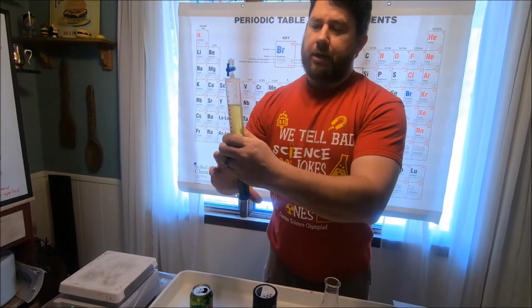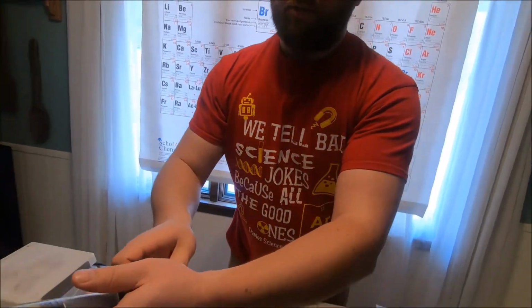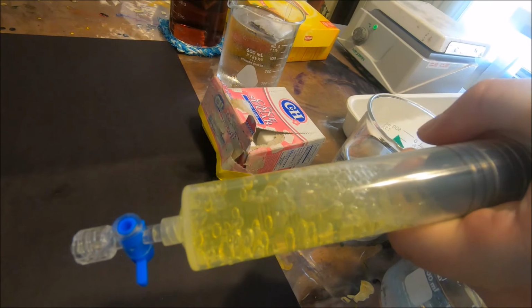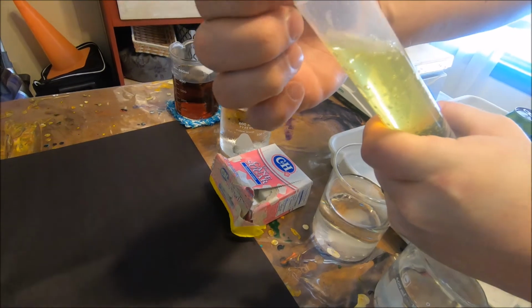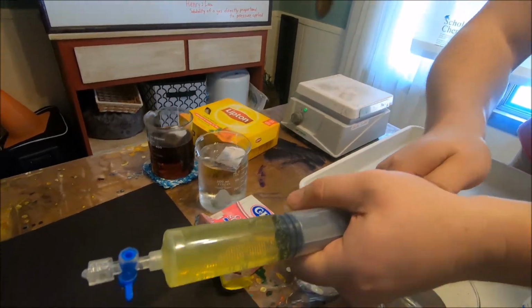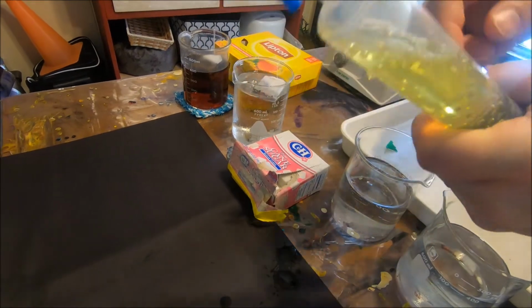What I'm going to do is move all that liquid towards the top and close that syringe. As we pull the volume back, the pressure decreases, and you can start to see more and more bubbles come out of solution. Now if I open it back up, you can hear that gas coming out of solution. We close the syringe back up, and this time when I pull it open to make more volume, you can see that pressure is decreasing, allowing that gas to come out of solution.